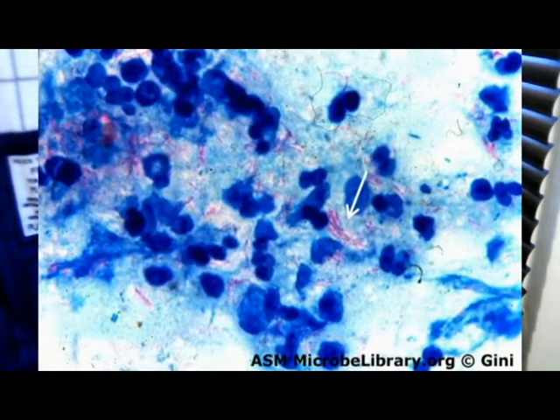Another example of a differential stain in addition to the gram stain is the acid-fast stain. This is one that you did in lab. Mannitol salt agar was used in Lab 3. This is an example of a selective media, so that could be a question: give an example of a selective media. So the mannitol salt agar will change color back to the regular agar color, so back to the TSA color, once a certain bacteria is grown on it.